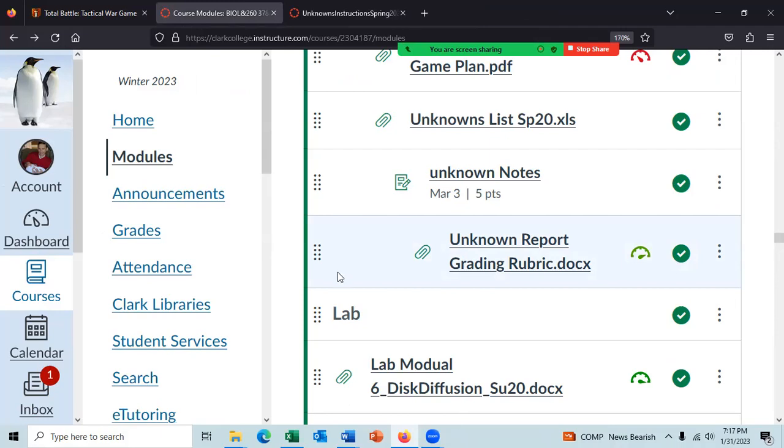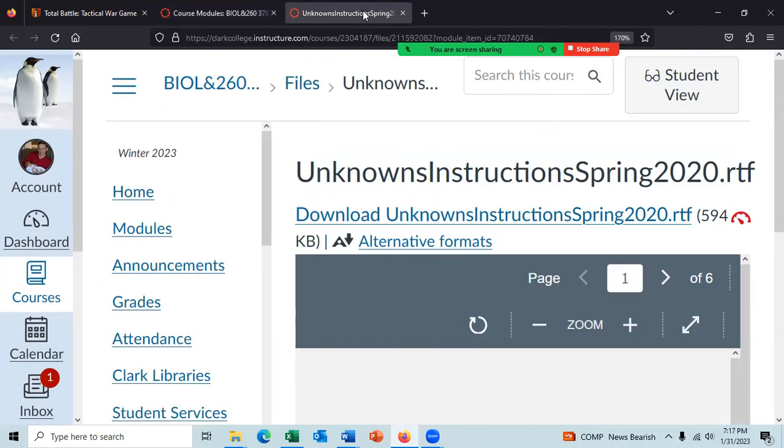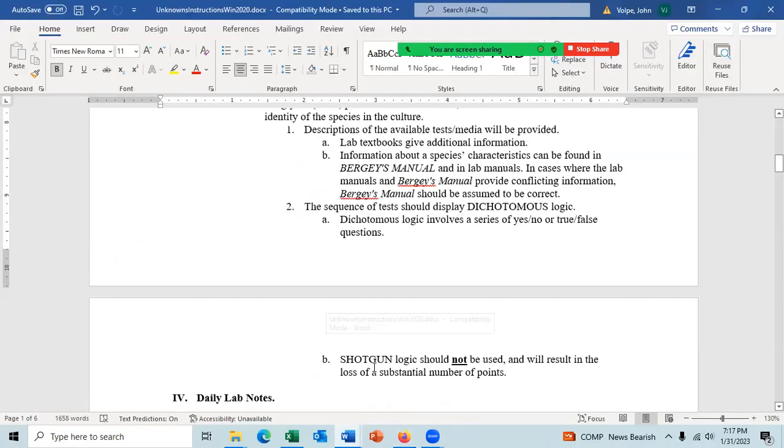All right. Any questions about any of that? So let's go back to our directions. The point is you should use dichotomous logic. If you're using dichotomous logic, you're only requesting one test each time. What you can do is request a test that you can get the results for in one day, and then the next day, you can request the longer test, the test that takes 2 days or longer to run.